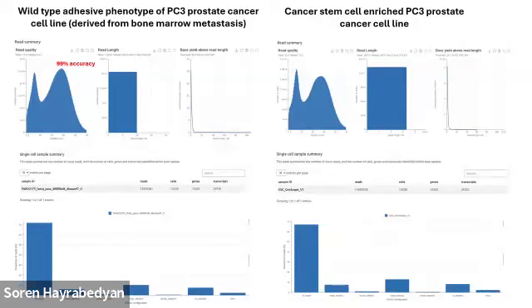It means that half of the library, the molecules inside, are at least 5 kb long, which is enough to detect most of the full-length RNAs. 70% of the RNAs were detected and mapped to the GFF transcriptome.